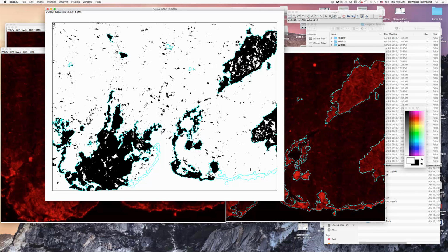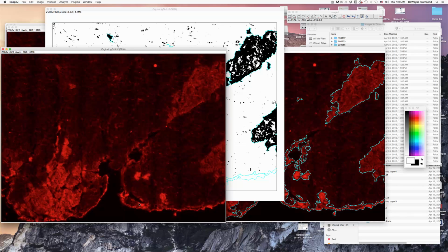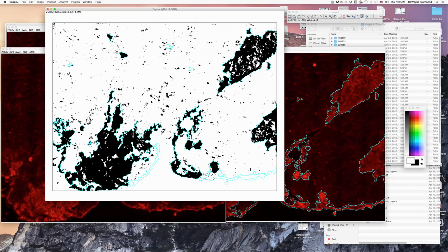We'll get an opportunity to assess that in a little bit. So you just basically are removing this area here. Okay. Now you don't have to do it perfect, right? It has to just get below that 1000 pixel threshold. So here's another little tricky area. One might be inclined to keep some of this, but this is probably extraneous. So we have to figure out how to do that.